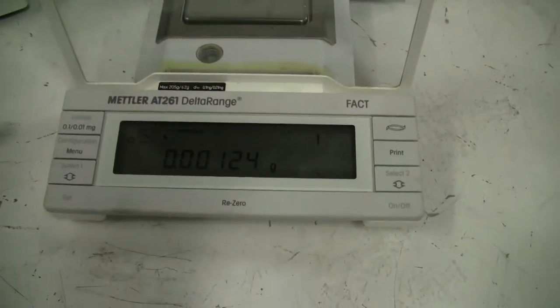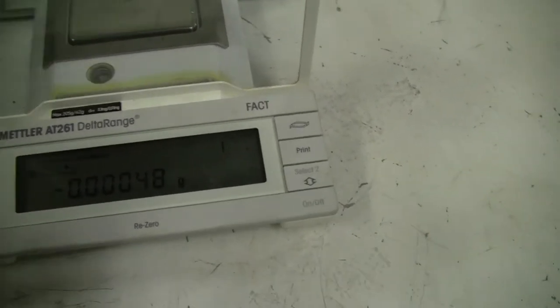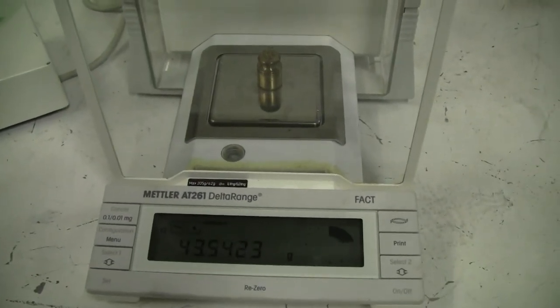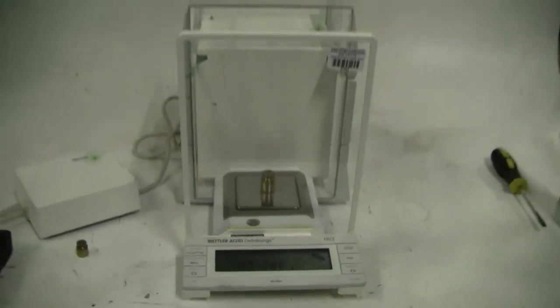We've got a max of 205 grams in this. Let's put 50 on there. There you have it, working nicely.